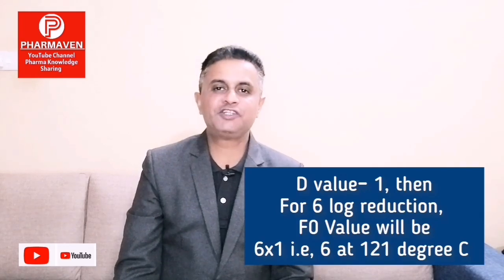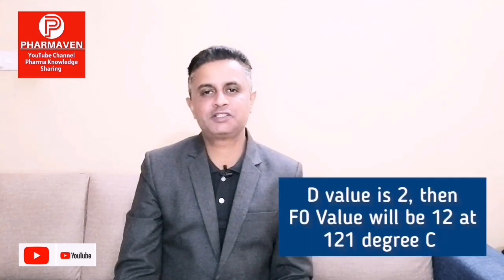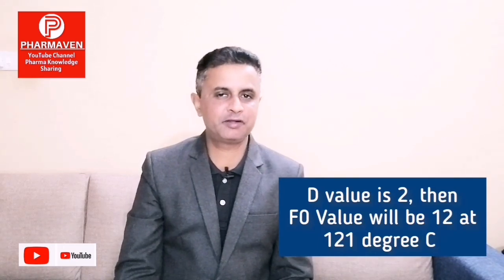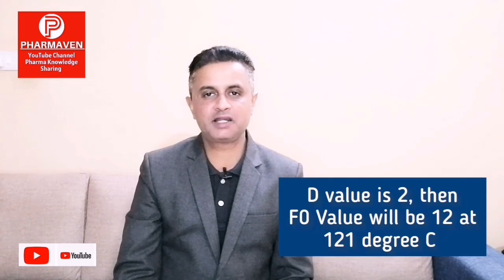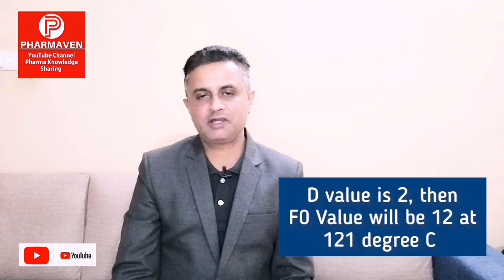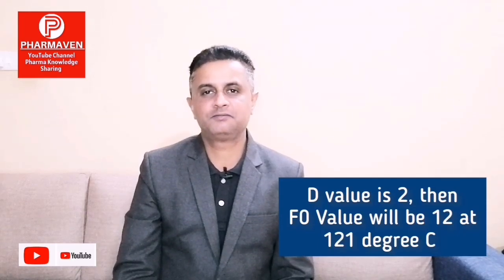If D value is 2 and if I want to achieve 6 log reduction, then my required F0 value at 121 degree will be 6 multiplied by 2, that is 12. So F0 value will be 12. So I have to expose my cycle at 12 minutes at 121 degree to achieve 6 log reduction. So this is how we can calculate F0 value when we know the spore population of the biological indicator. Basis that, we can calculate F0 value by this method.